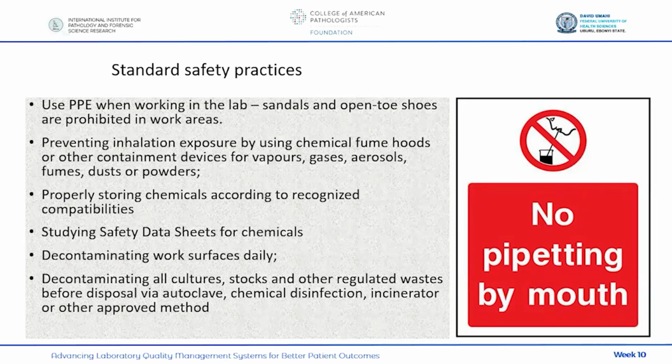Sandals and open-toe shoes are prohibited in work areas. I remember quite vividly, these were part of the instructions we were given as young professionals coming into the lab for the first time. We were strictly told sandals, open-toe shoes are prohibited. I hope our younger ones are still keeping to this. Preventing inhalation exposure by using chemical fume hoods and other containment devices for vapors, gases, aerosols, fumes, dusts, or powders.